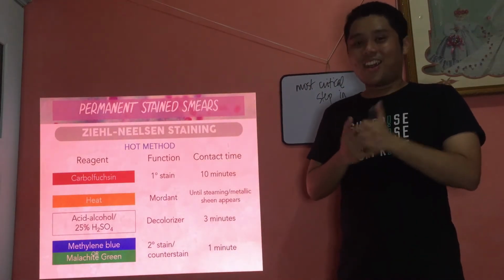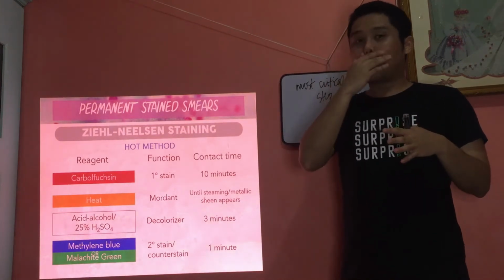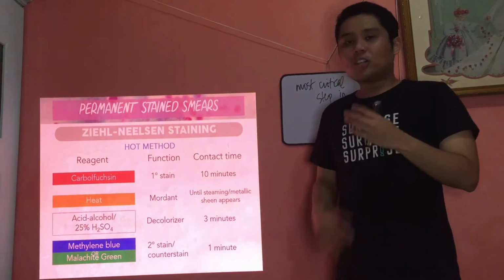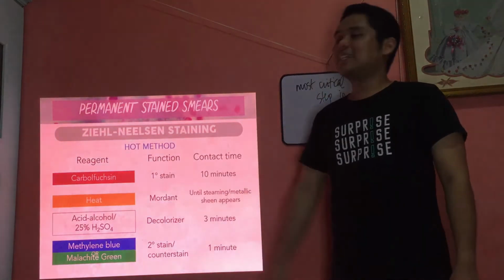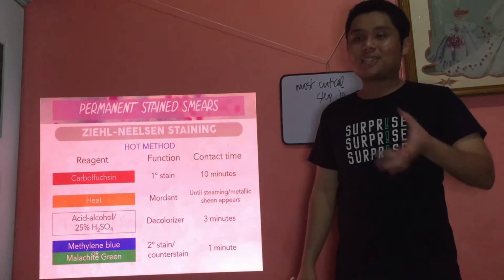Sana naman. Alright, okay, that's for differential staining. Same procedure lang with gram staining. The difference lang are the reagents. Okay? Alright. Now, why is it called hot method? It's because the heat will serve as our mordant. That's why it's called hot method, because we use heat as the mordant.